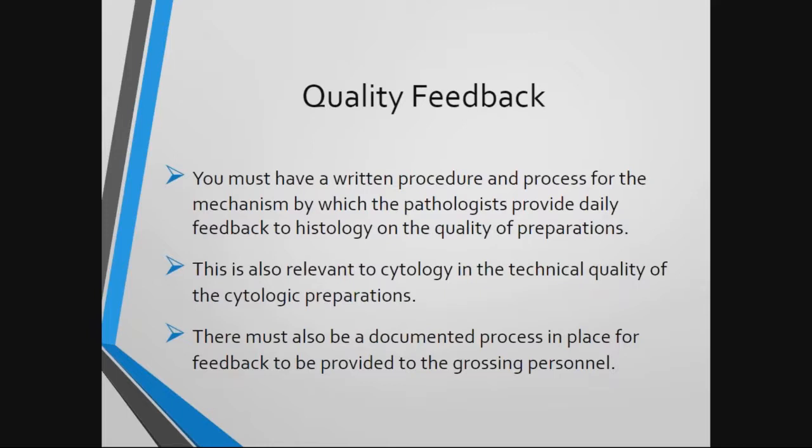Finally, documentation must exist for feedback to be given to the grossing personnel, relevant to pathology assistants or other non-pathology lab personnel who might be performing gross activities. Because histology workflows are such that they flow through those different groups of people, it is important that each group does not work in a silo. Feedback should flow back and forth so that improvement can be made if needed and issues are addressed. CAP inspections focus on this concept and are particularly interested in what was done as corrective action for feedback given.